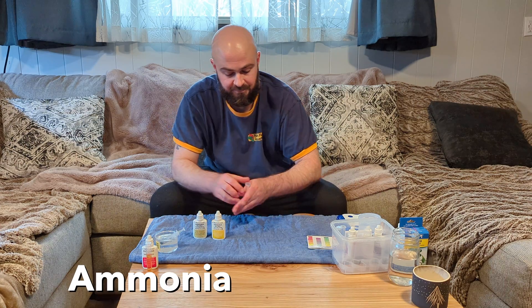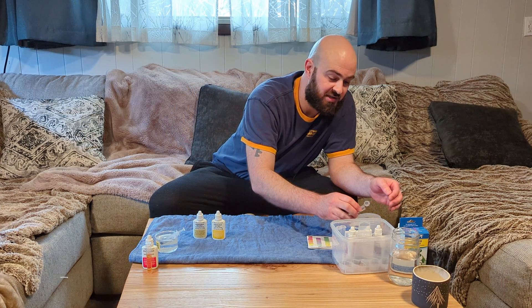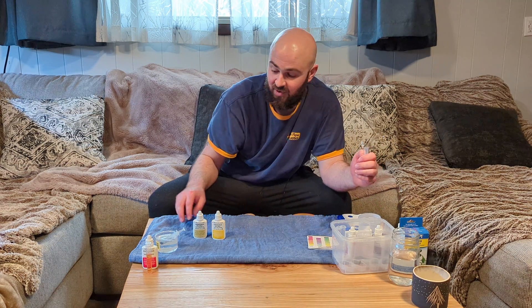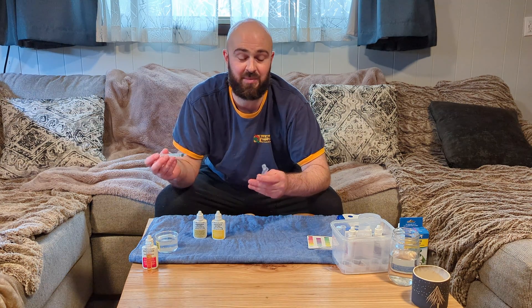Next we have ammonia. Ammonia is important to test for if you have a new tank. I pulled this from one of my client's tanks that's currently cycling, since I don't have any ammonia in my home tanks.